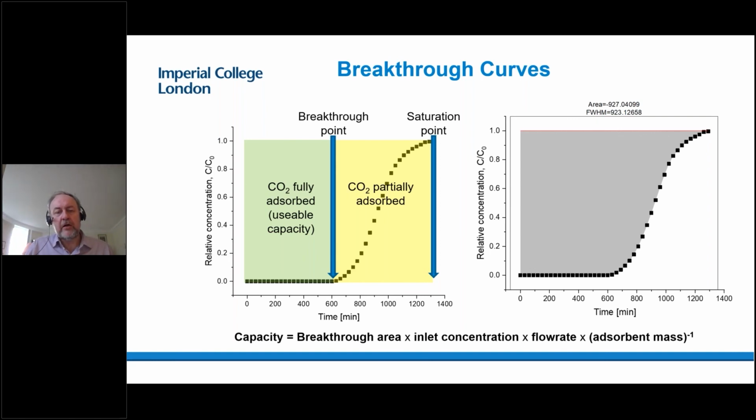So if it's a near IR, FTIR, yes, that's right. The thing you have to be slightly concerned about is that near IR and IR typically have large gas cells. If you've got low concentrations, you may end up with a large gas cell, and large gas cells take up a lot of volume, so they add a long time constant onto your measurement. So that's the only concern, is that the volume of the measurement that you might need in the gas cell for IR might affect the accuracy of measurements. Mass spec wouldn't have the same problem, although of course they can be less quantitative for concentration determination. So mass spec or near IR or FTIR both have a role. Just a question of thinking about the concentrations and the system structures to make sure you get the right sort of performance. But they would be possible.